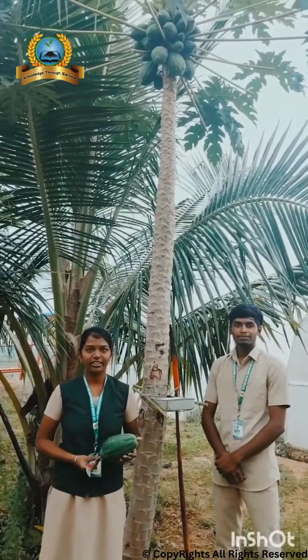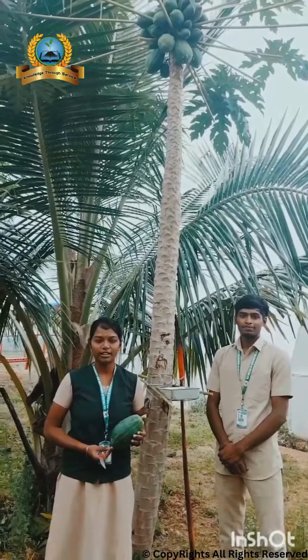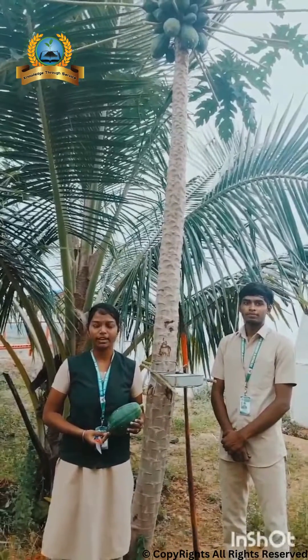Welcome to all. I am Vankateshwari and he is Sasi Kumar from the 2022 Bachelor of JSA College of Agriculture and Technology, Department of Agriculture. Today we see about how to extract the Papain from the Papaya.